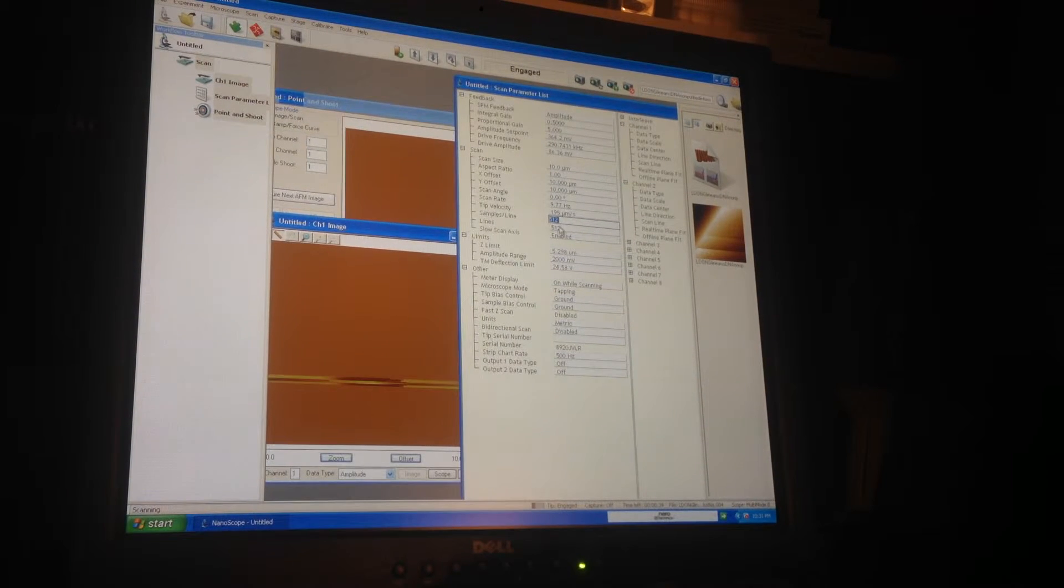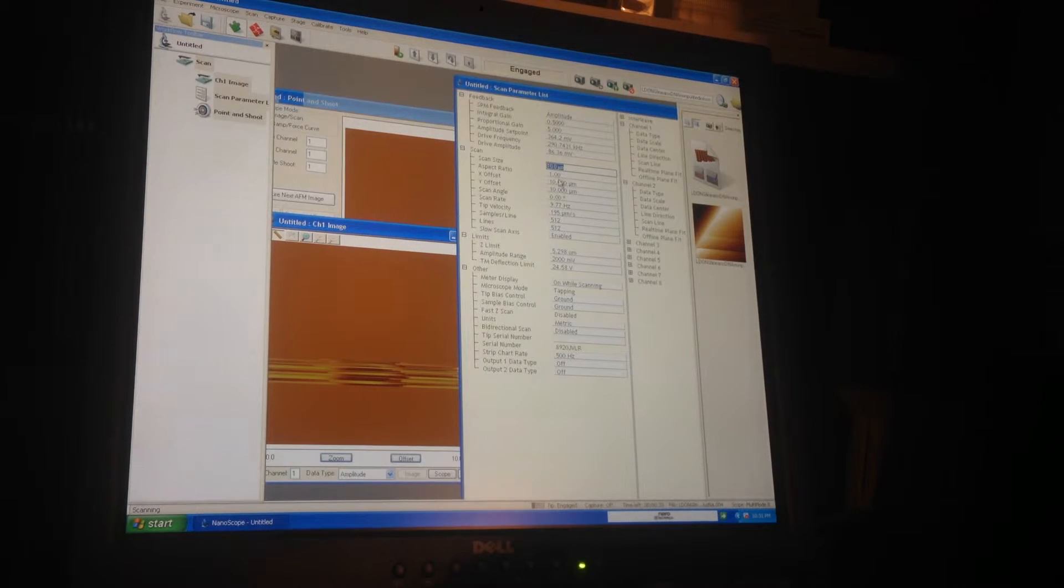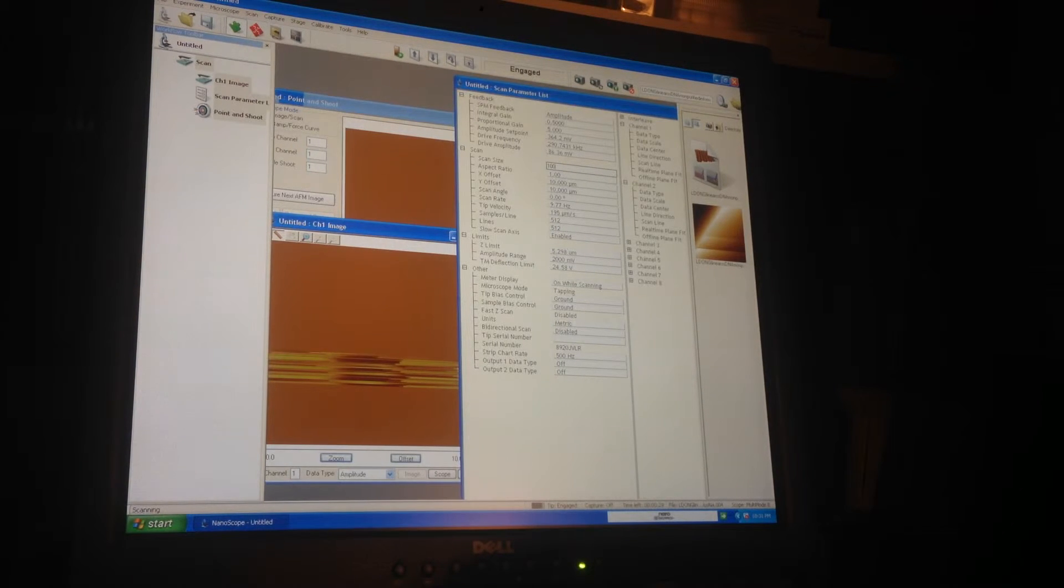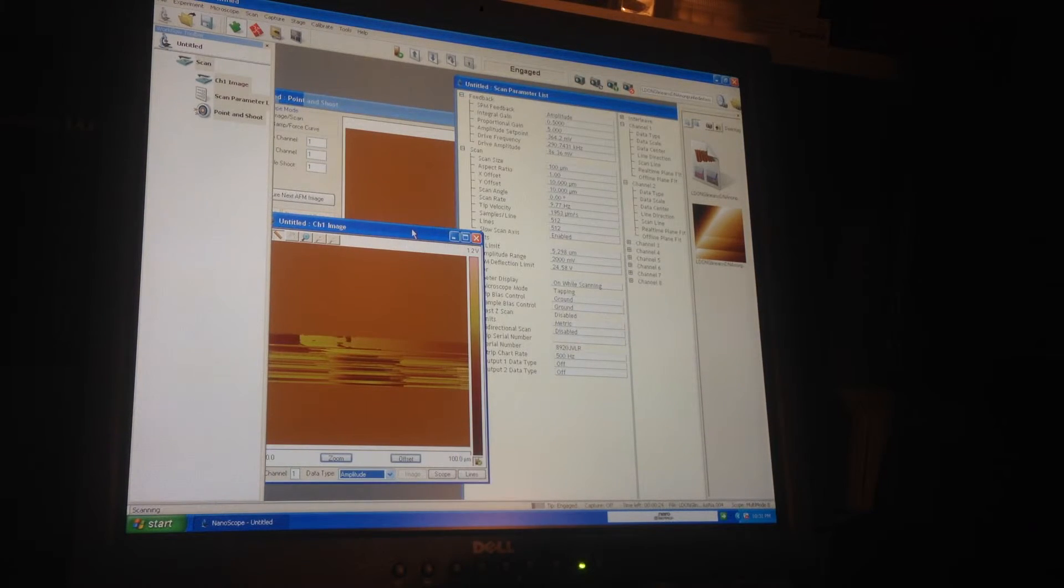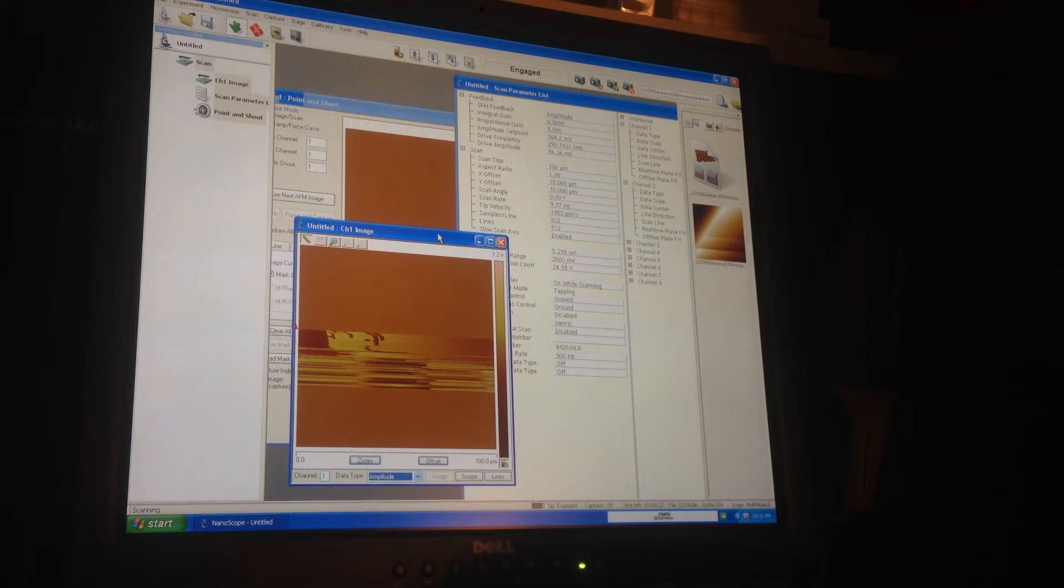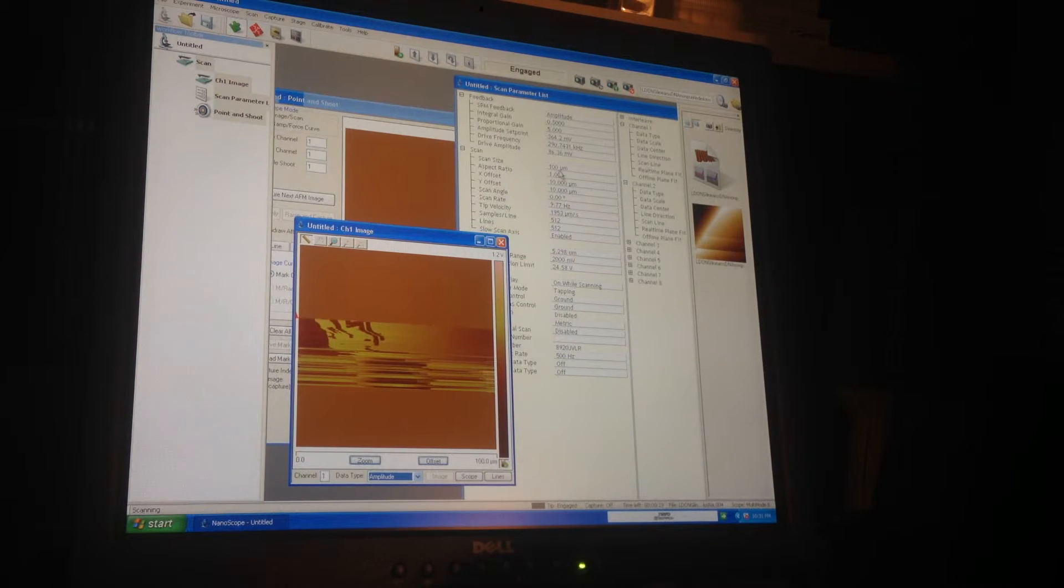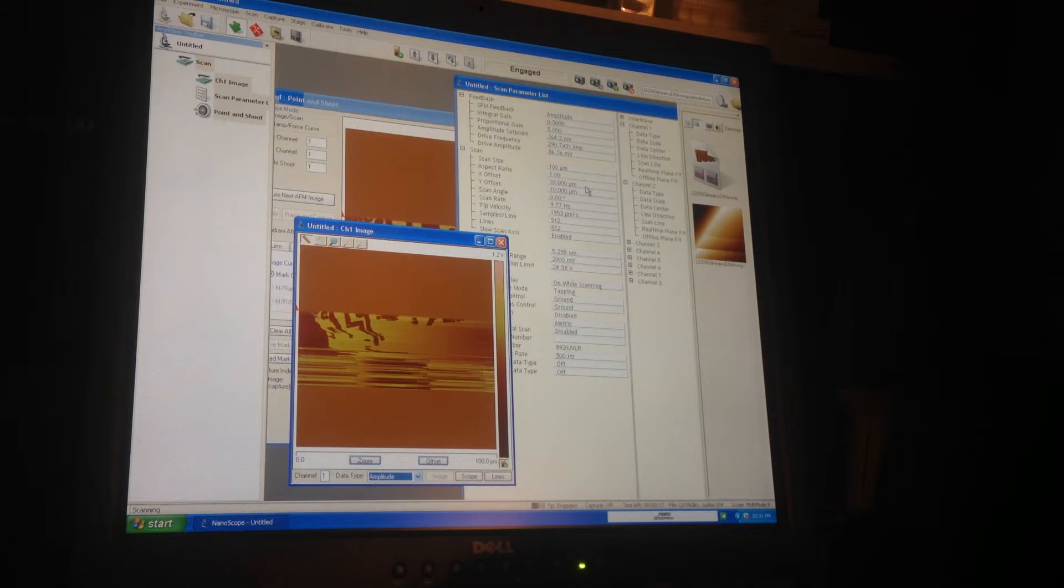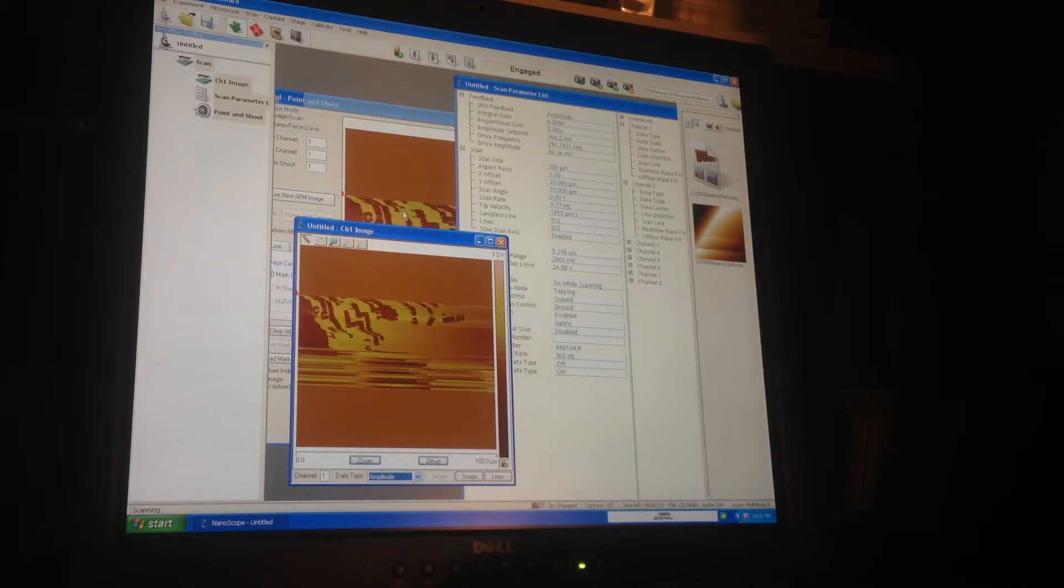I pushed up the scan resolution. It took me lots and lots of fiddling. Okay, there we go, so I've pushed out the scan size to 100 microns, so imaging even more of the area now.